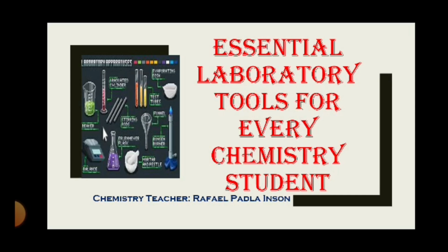In the next session, I understand that you will handle the apparatus and use this knowledge. But before initiating any laboratory work, it is crucial to acquaint yourself with a diverse array of instruments and apparatus exclusive to laboratory settings. While these tools may not be commonly encountered elsewhere, they play a vital role in conducting experiments effectively.